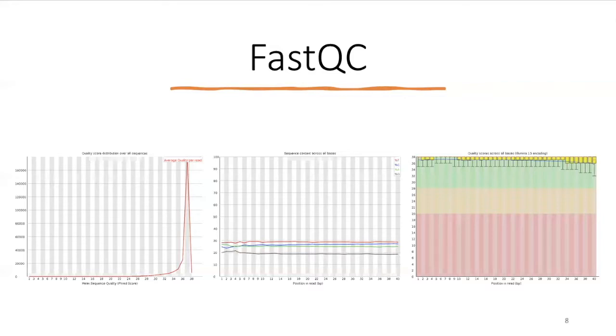So I've never seen this, and I guess it was written at that time when the reads were supposed to be short. Nowadays, if you run FastQC, you're going to see a few warnings for some of the metrics, but that doesn't mean your sequencing is wrong. It's just standard for FastQC.